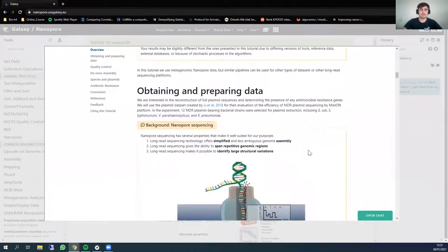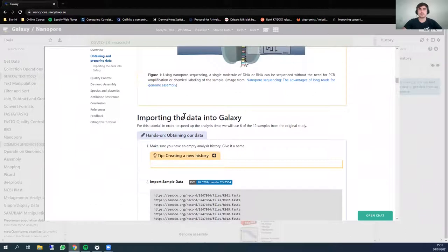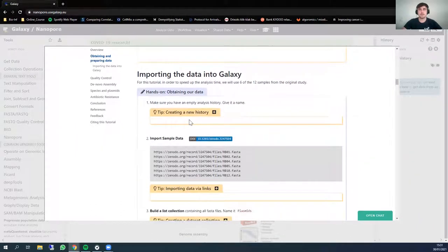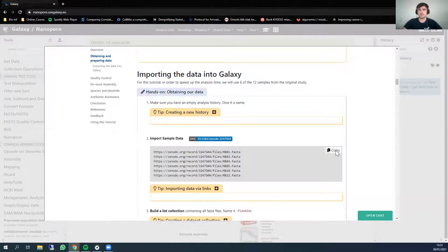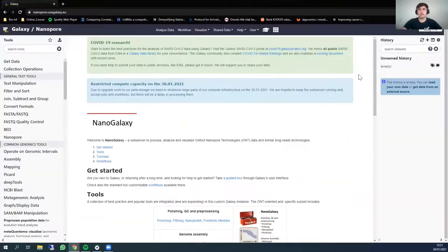The first step is to obtain the data that we will use, and for that we will import it into Galaxy. First you start by creating a new history, and then we will import the sample data. For that we will copy the links here and import them into the new history. So we create a new history.